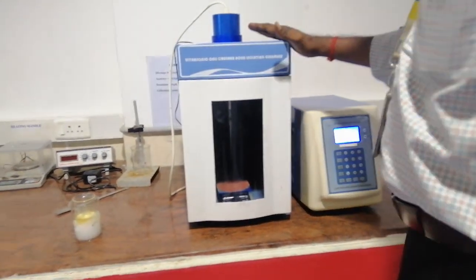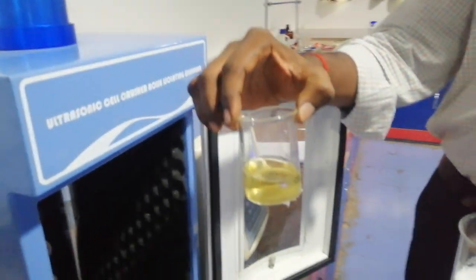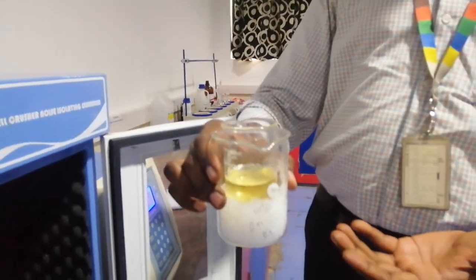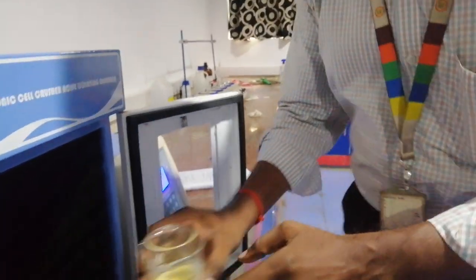Inside, you are going to keep a sample. So this is your sample, say E. coli culture, and it is kept in a beaker which contains ice. Therefore, when heat is generated during the ultrasonication, that heat can be dissipated using the ice.